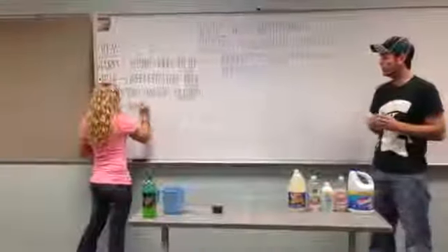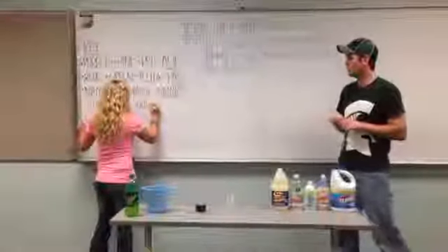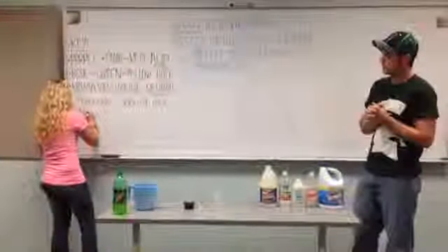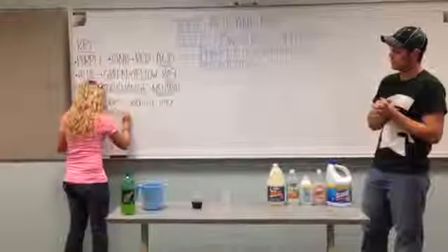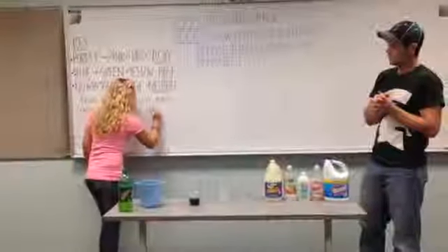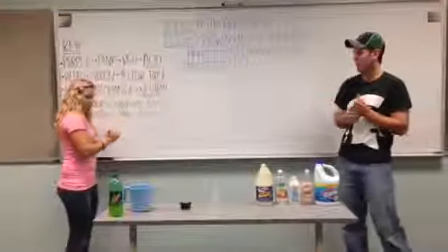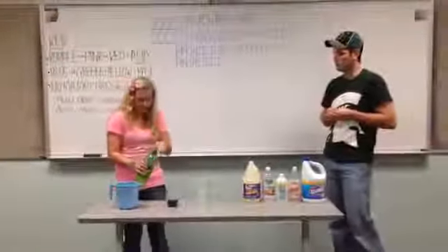That is a very good question. When you're done writing that, you're going to test it in our indicator base and see if it changes the color or what color it changes into. Okay, now go ahead and try out your question. Now, do I pour a little bit or a lot? You can pour as much as you want.